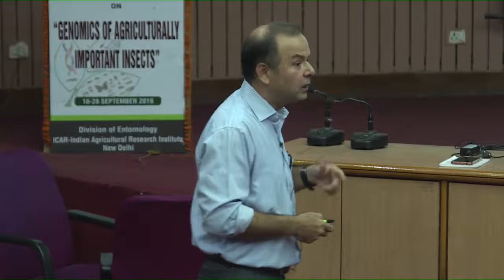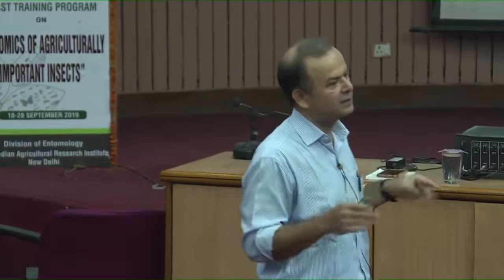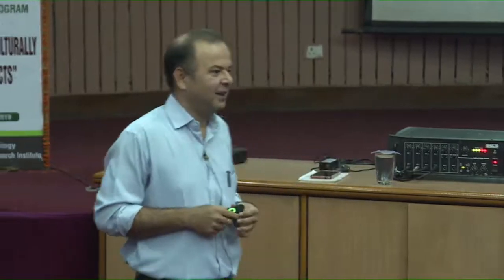So, you may argue that okay, if that is the condition, why do I take a risk? I will stop at 10 cycles. No, not taking risk, I will stop at 10 cycles. But then the problem is the amount has to be detectable. It should be detectable, right.